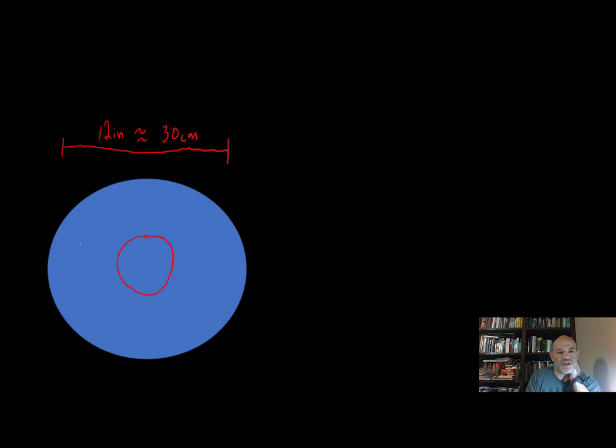Let's say that we have some large apples or some kind of a fruit on there. And when I put them on the plate, they're not all the exact same size. But what I do see is that roughly 3 fit all the way across the plate. And so if I know that that plate is 12 inches or 30 centimeters, you can actually use that information to estimate the size pretty quickly, because if about 3 fit all the way across the plate, then it's almost intuitive to say, let me just take the diameter and divide by the number of apples that go all the way across, and that would give me an estimate of the size of one of the apples, at least the average size for them. So what are we actually doing there?